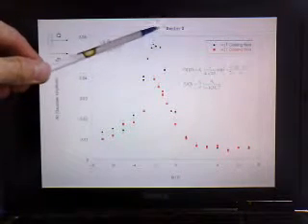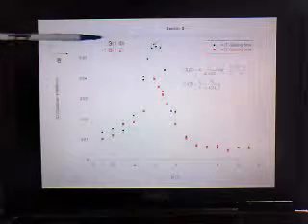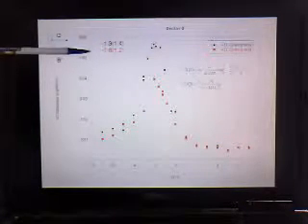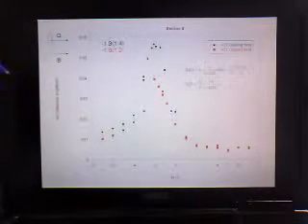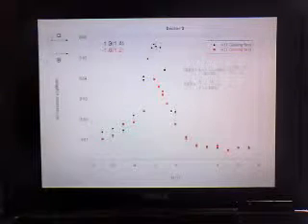Now this is taken for sector 0. Sector 0, remember, means that Q is parallel to B, the applied field, which means that the magnetization that we're measuring is in a plane perpendicular to Q, so it would be like in this direction over here.